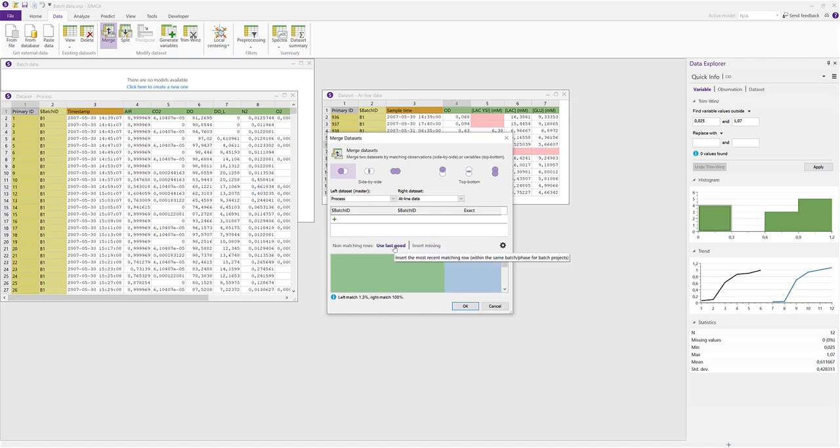Using a last good value is recommended for this type of data, since the at-line columns otherwise would have a very high degree of missing data, and that negatively affects the modeling.